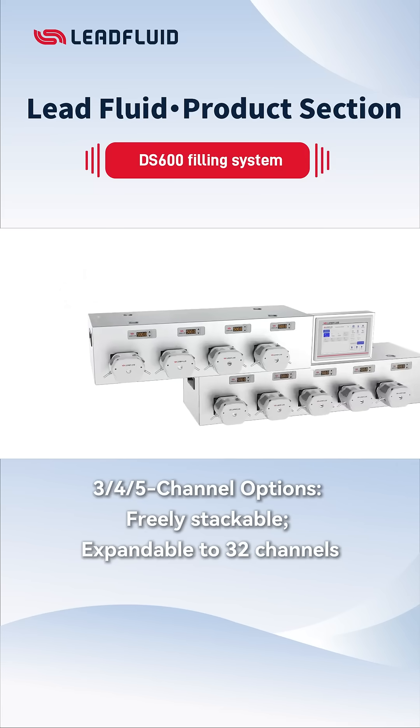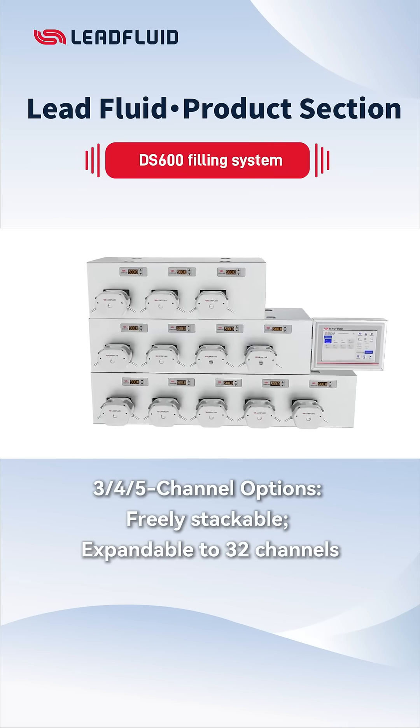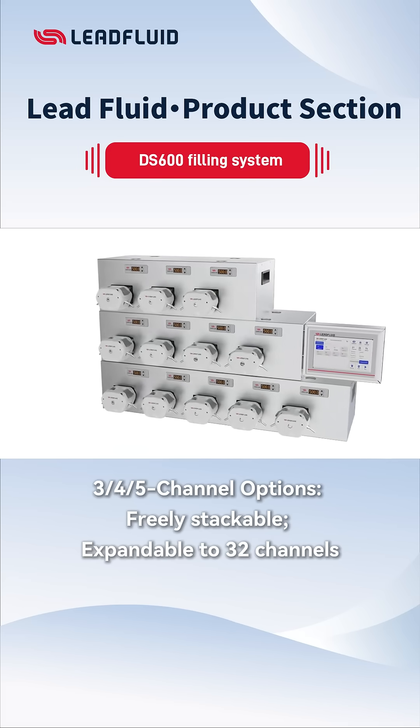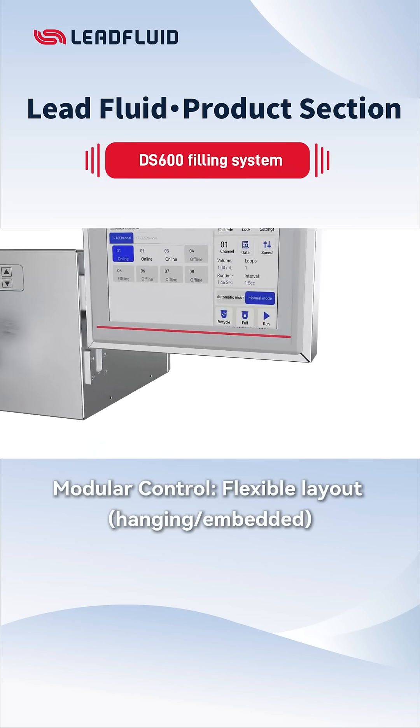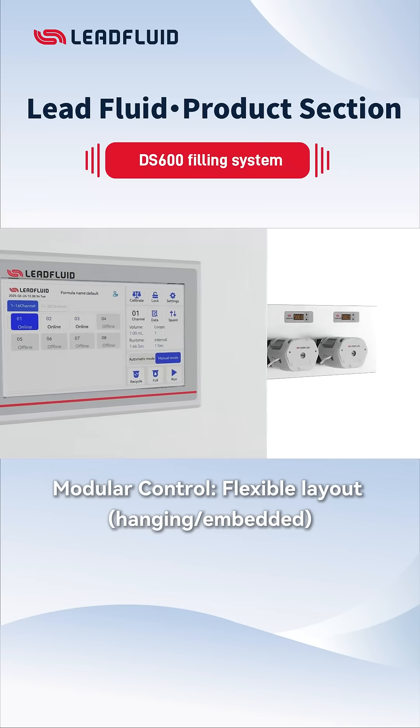Channel options include three, four, or five channel modules, freely stackable to adapt to complex needs, scalable to 32 channels. Modular control supports hanging or embedded installation for flexible layout in any production space.